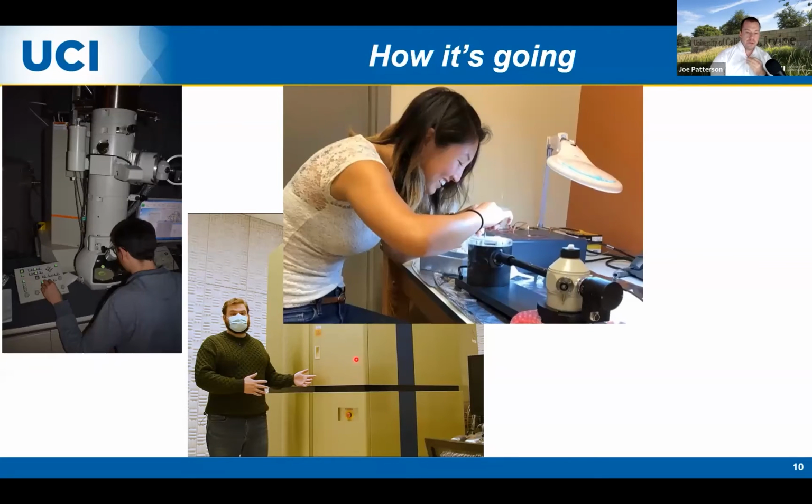Some of the hardest things we have to do with electron microscopy is actually preparing the samples. And this is Alana. She was a postdoc in my lab, and we can see her here preparing some samples for cryo electron microscopy. To make these, you have to work under liquid nitrogen. So inside this container here, it's full of liquid nitrogen, and she's very carefully manipulating her samples in order to get them in the right place.